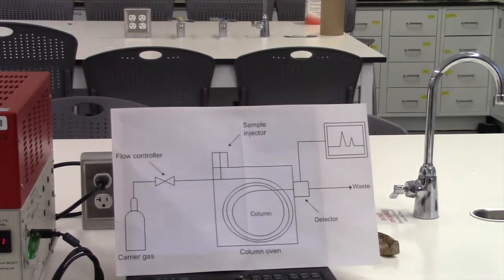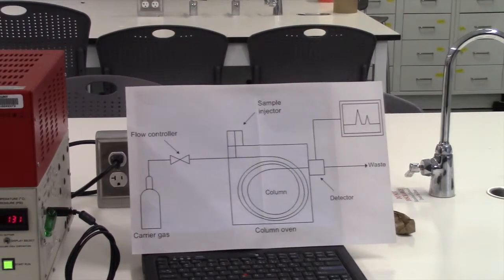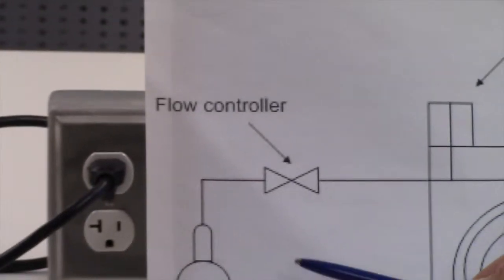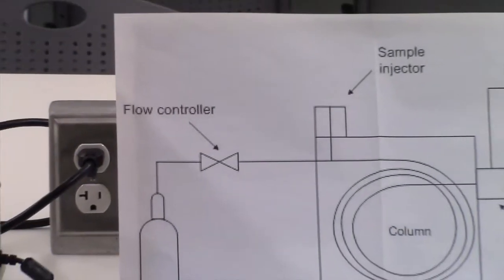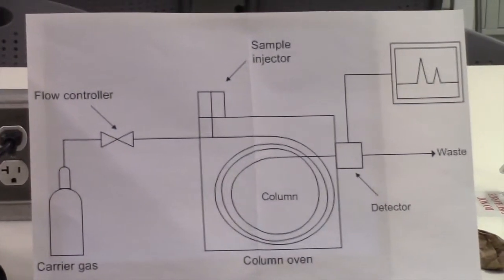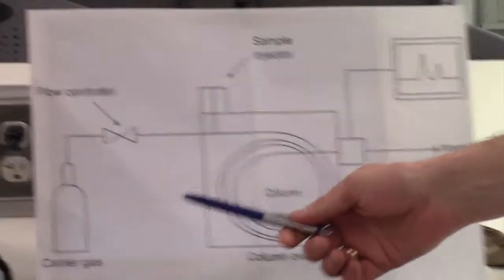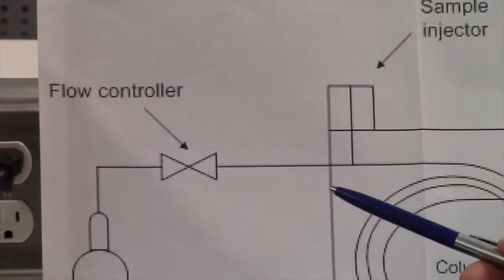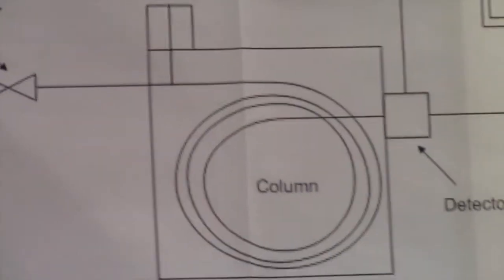And of course, you see the main structure of any gas chromatograph, and usually it consists of a carrier gas. In our case, it's just plain air, which makes it a lot easier to operate in the field or in any lab, even the smallest one. Then we have a flow controller, or in our case a pump, which pumps a predefined amount of air through the separation column.